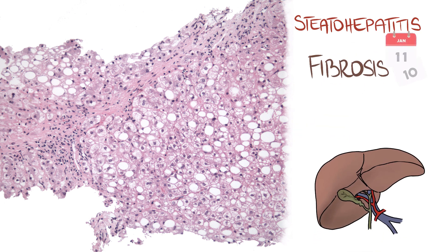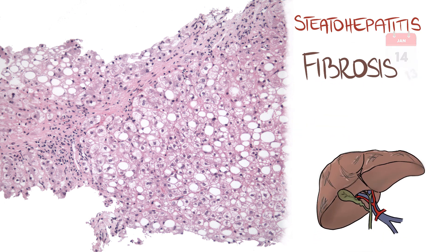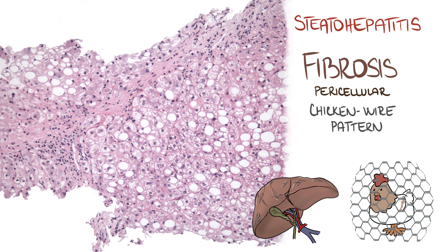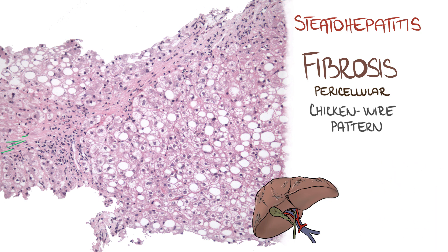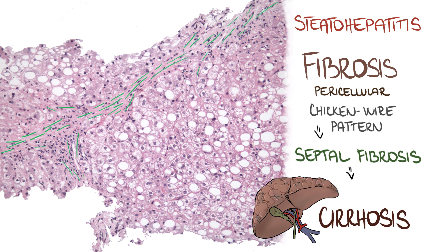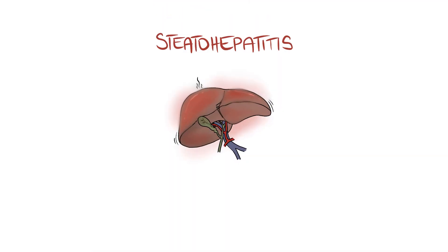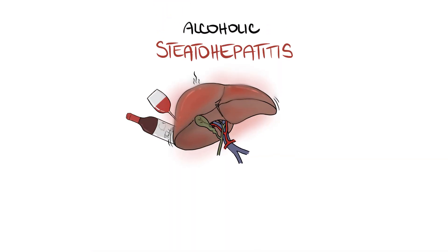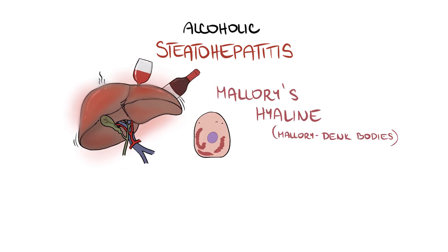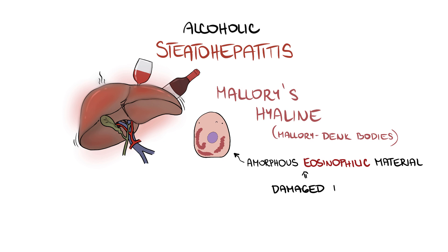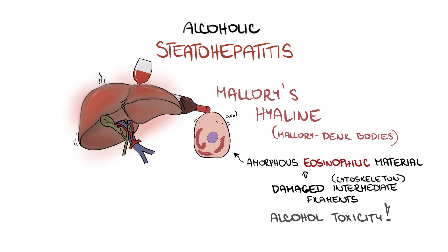In the course of time, fibrosis may develop. Such fibrosis usually starts as pericellular, forming a so-called chicken wire pattern. As time passes, it may progress into septal fibrosis, which you can see in the picture, and later into cirrhosis. In the case of alcoholic steatohepatitis, we can also find so-called Mallory's hyaline or Mallory-Denk bodies. This amorphous eosinophilic material in the cytoplasm of hepatocytes is in fact a clump of damaged intermediate filaments, as a consequence of alcohol toxicity to the cytoskeleton of hepatocytes.